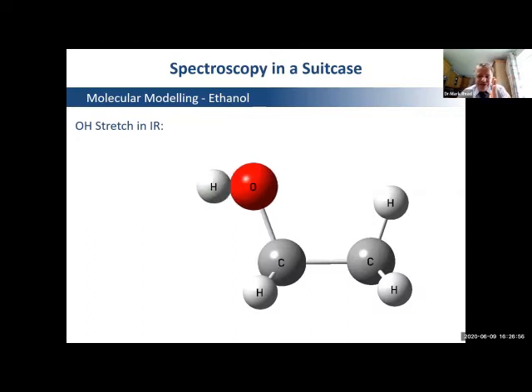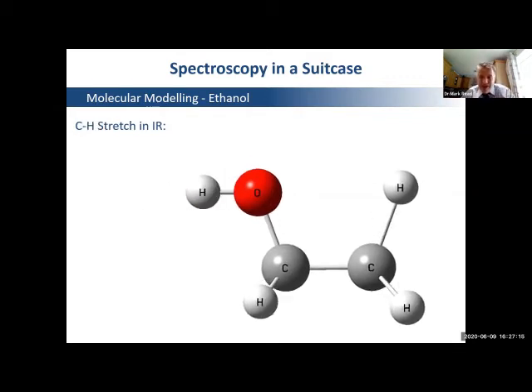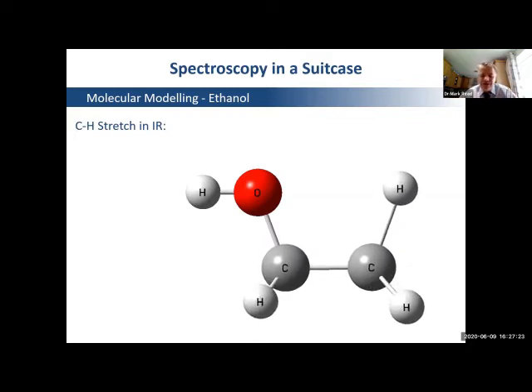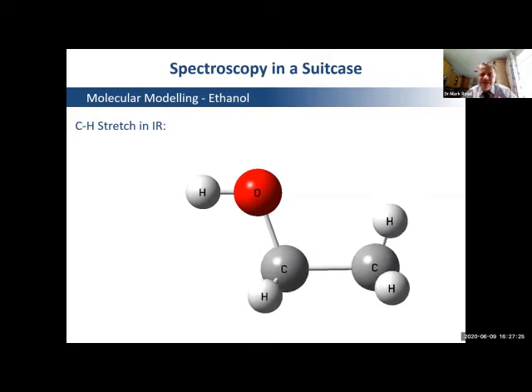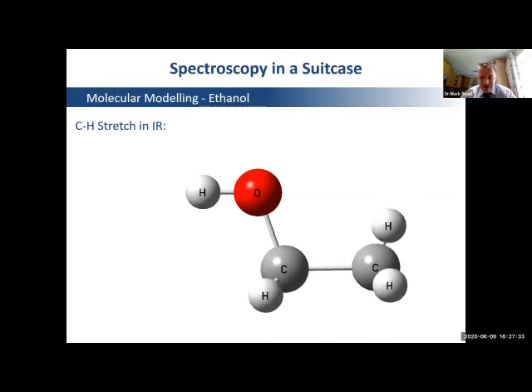Now, if I move down my spectrum slightly, there comes a peak that matches the vibration of the carbon and the hydrogen. It's still a single bond, but obviously carbon has a lower mass than oxygen, so a slightly different energy. What happens to our molecule when I get to that wave number? Well, now, of course, the CHs absorb that energy. The OH doesn't anymore because it's different. So now I've only got a response to the CH. So again, it's unique. We've identified it uniquely. So this is why in the region above 1500, I can uniquely assign peaks to bonds through the vibrations.